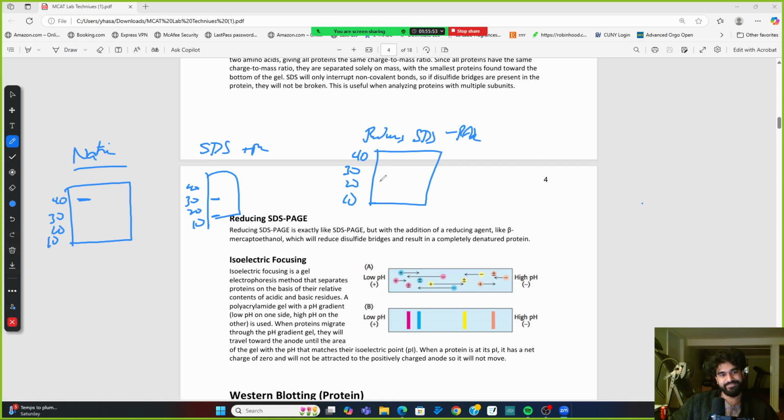All right. Guys, look at this. Look at this. Ready? There's the SDS, right? So let's answer some questions just by looking at the native and then the SDS as well. So now we know that there's 2 subunits and they're linked what? Covalently or non-covalently? Non-covalently, because we're able to get between them using the SDS, right?